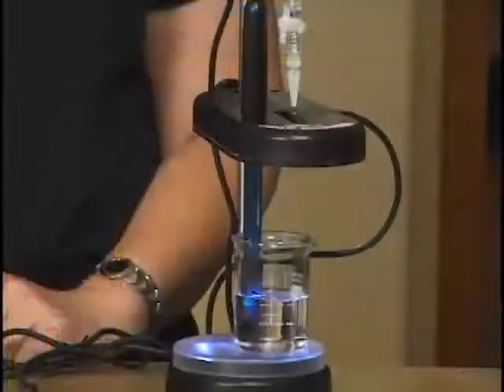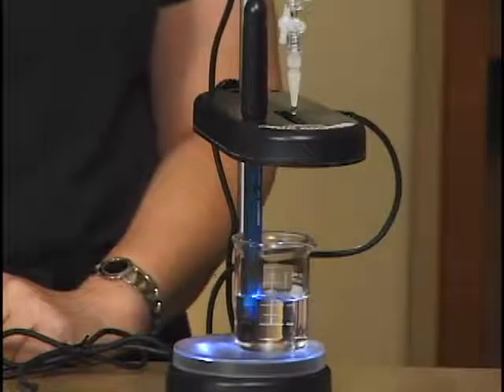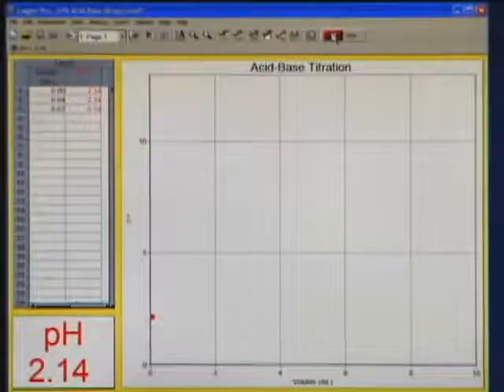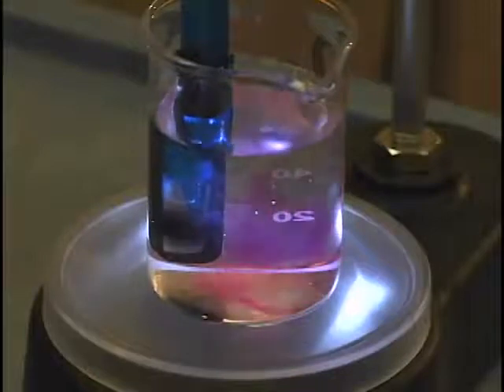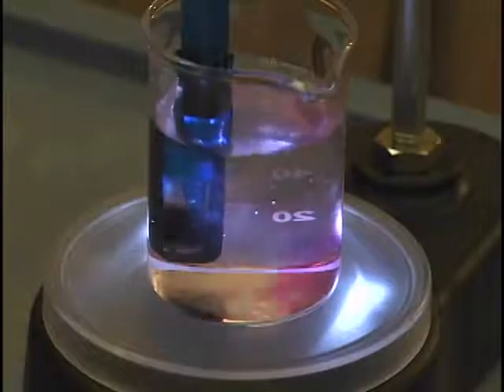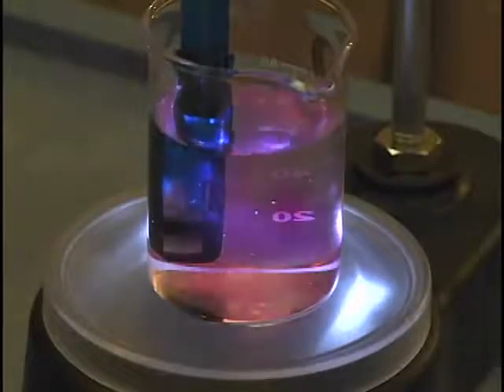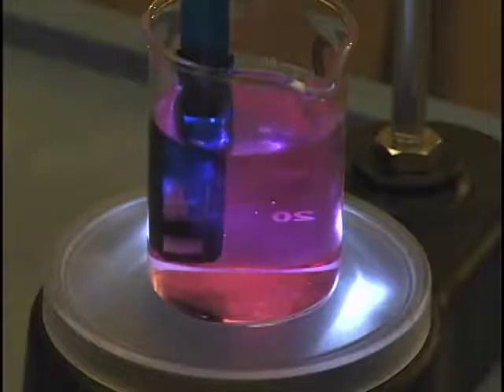And here they come. So here comes our data and we just need to let this progress as our titration proceeds. I put some phenolphthalein in here and you can see as each drop goes in we're getting some pink. It's lingering longer with each drop, so we're really close to the equivalence point now. It looks like we are there. We'll let it keep dropping a little while longer so we can get an upper tail on our titration curve.